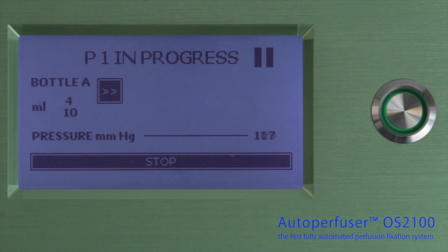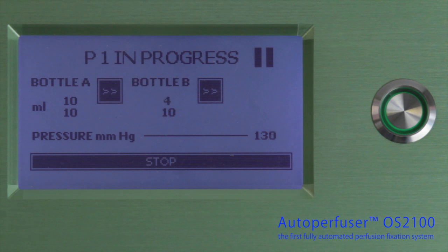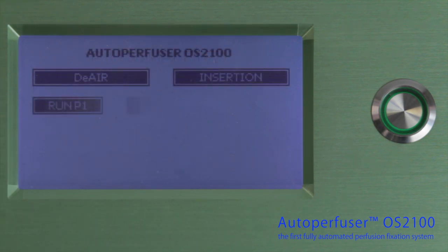The Autoperfuser delivers the solutions in a pulsating manner, mimicking the physiological blood flow, hence eliminating the risk of blood vessel rupture. A perfect perfusion is achieved. The result is consistent and reproducible.